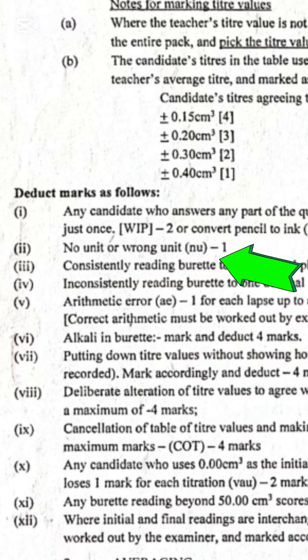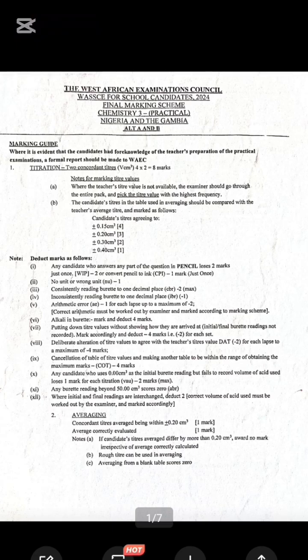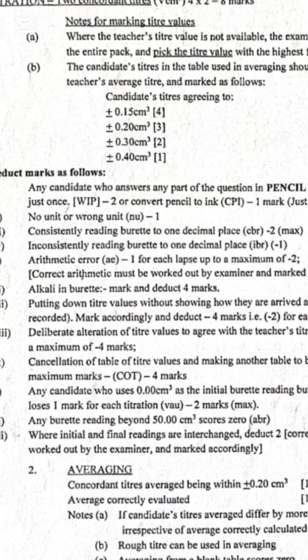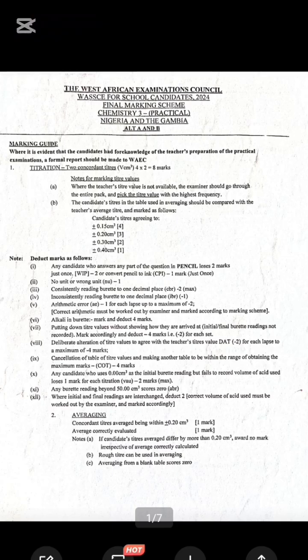Number two: no unit or wrong unit — either one — is minus one. That makes minus three now. Number three: consistently reading the burette to one decimal place — we call it CBR — that's minus two. When you add that to minus three, it gives us minus five.